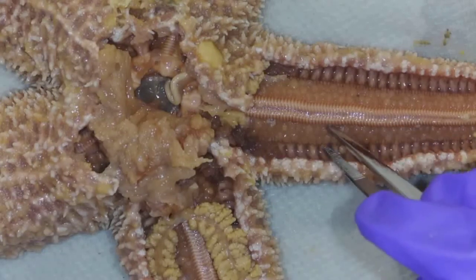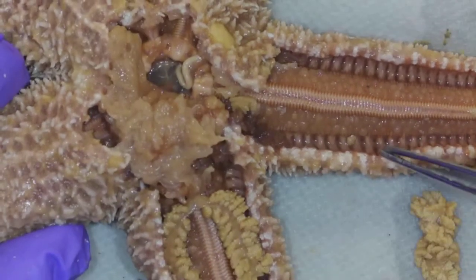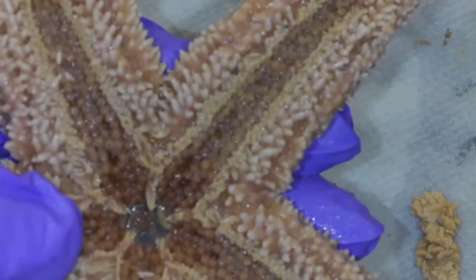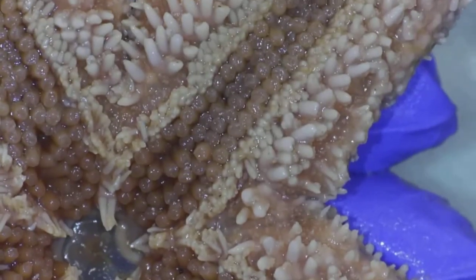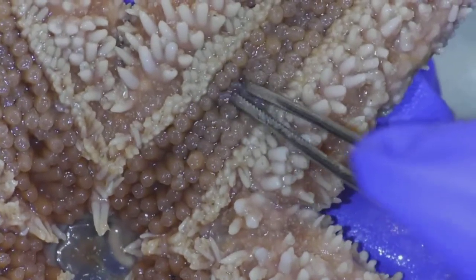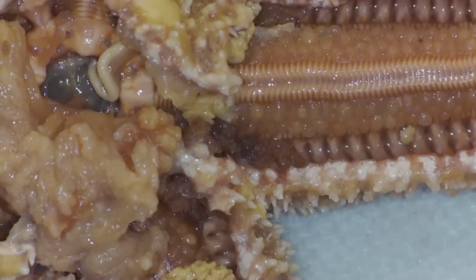These pink squishy structures are called the ampulla. They're like a little bulb, and if they get squeezed, water shoots down into the tube foot. The tube foot is right on the other side, so let's turn everybody over and take a magnified look at those tube feet. The tube feet are these guys here — they're individual, and there's a little suction cup on the bottom of each tube foot. So the full pathway is: madriporite, stone canal, ring canal, radial canal, ampulla, tube foot.